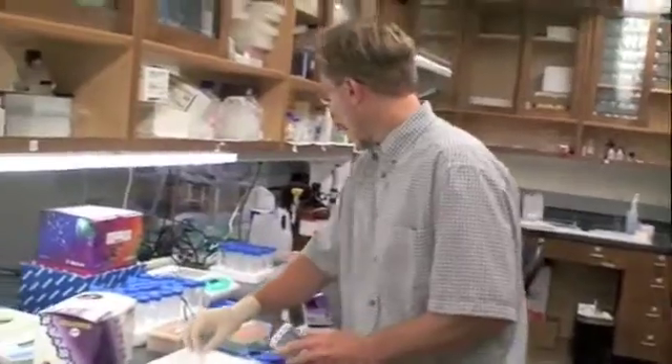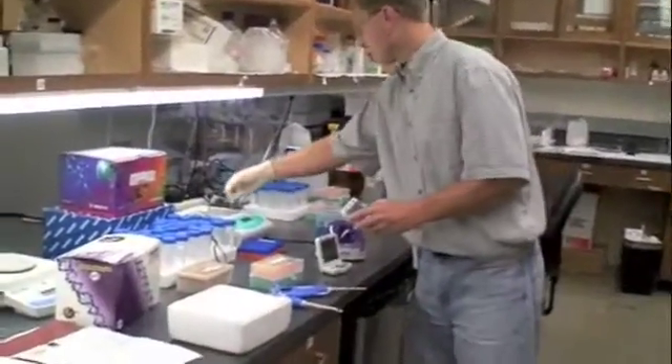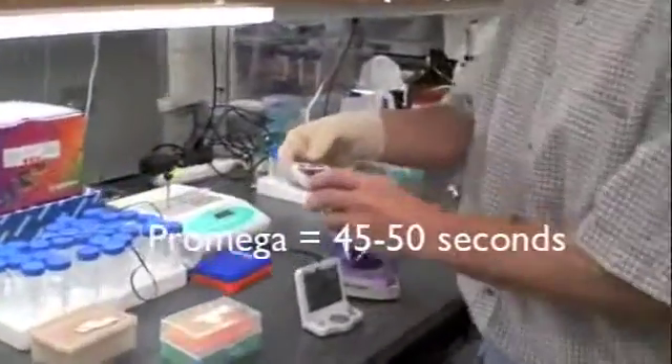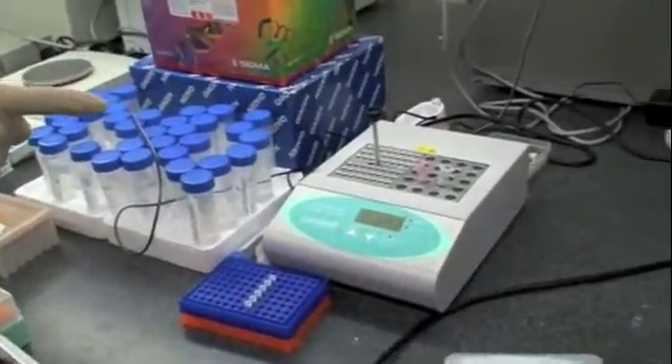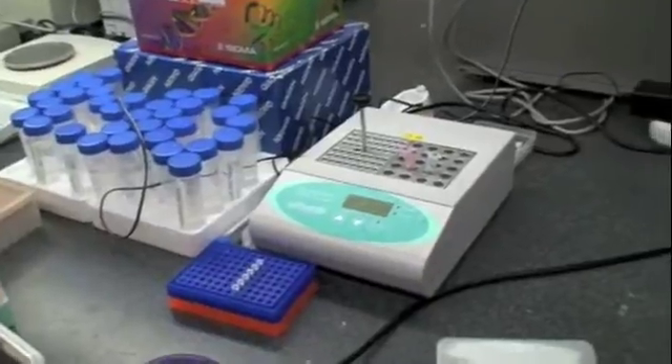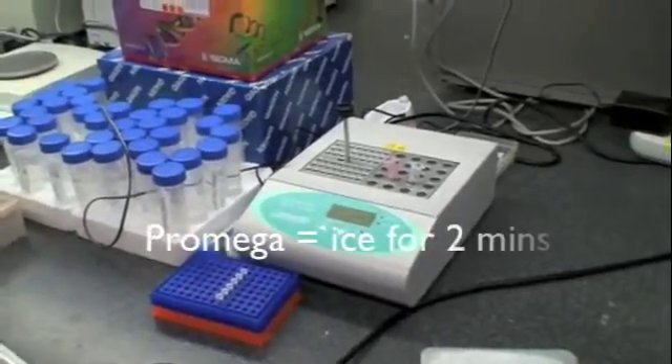So these are the cells. I'll move them over to 42 degrees for exactly 30 seconds. It says do not mix. And then once they've been in there for 30 seconds, I move them right back to the ice for five minutes.